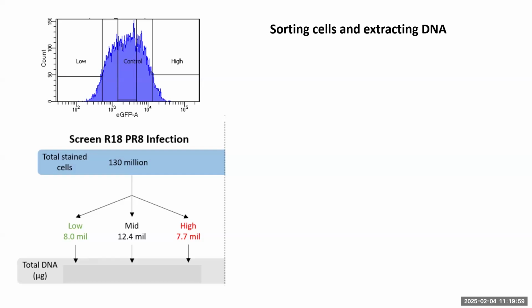I have just a question about how much time you leave the virus in the cells? Because I guess depending on how much time, you would be selecting for infection or replication. So if you leave the virus for 3 days instead of... You mean not the lentivirus, the actual virus, so influenza.